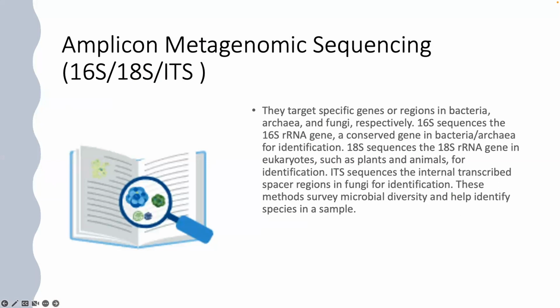So, Amplicon Metagenomic Sequencing. Essentially the same thing that was just talked about, but we're doing a PCR product that was mentioned in the back earlier, right? So 16S, 18S, and ITS. So we have bacterial, eukaryotic, and fungal rRNA components, and primer sets have been established for them. rRNA is highly conserved across these individuals.